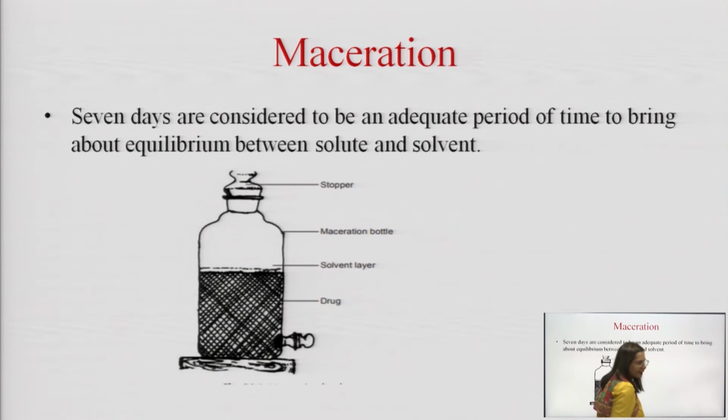Let us see the diagram of the macerating bottle with a lid. Here the solvent system is added to the drug material. The macerating technique is also very preferred in case of fresh sample materials which have high moisture content or certain volatile components, which are best imbibed in the cold stage.